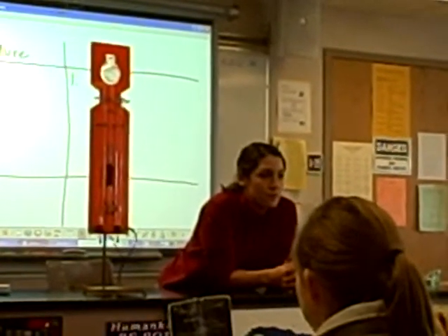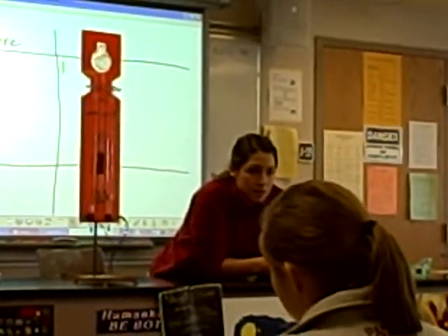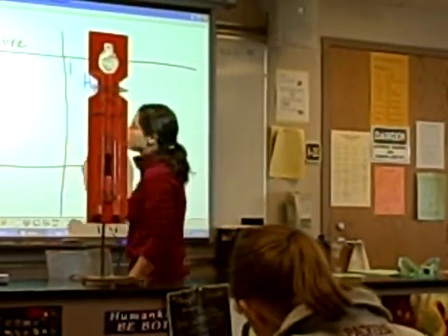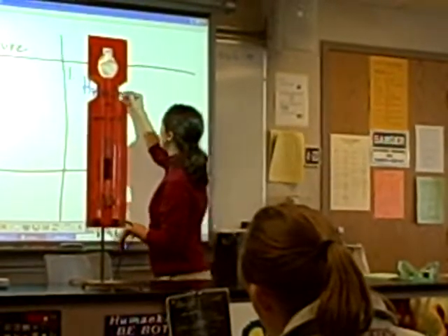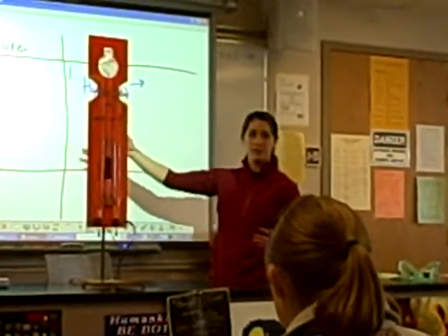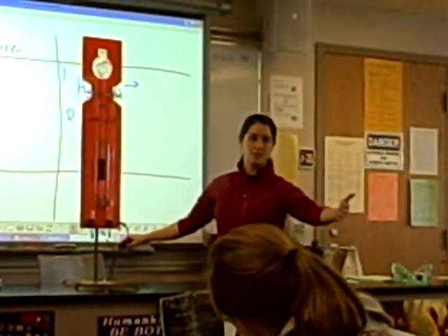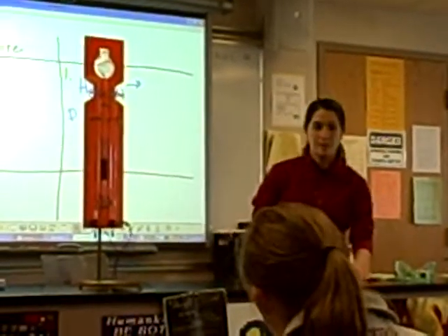Gas. Okay. So let's write down our reactant. What's our reactant again? Water. So write down H2O for your data, and write down its state. What state should we have for H2O? Liquid. Okay, so your one reactant. And you might want to do this for your other ones as you're going through. You could write a little note to yourself that it's decomposition, because it's something you're going to have to do in your analysis. Okay. So you write D down? Yep, so I just make a little note.